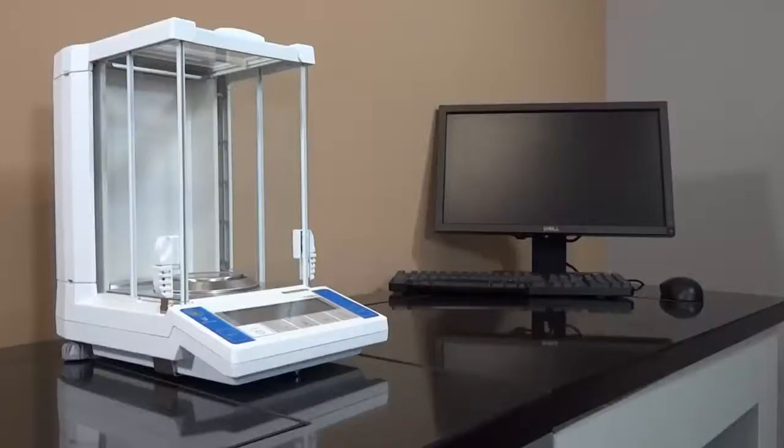The LF is a complete solution to any laboratory requests, from semi-micro to analytical weighing performance.